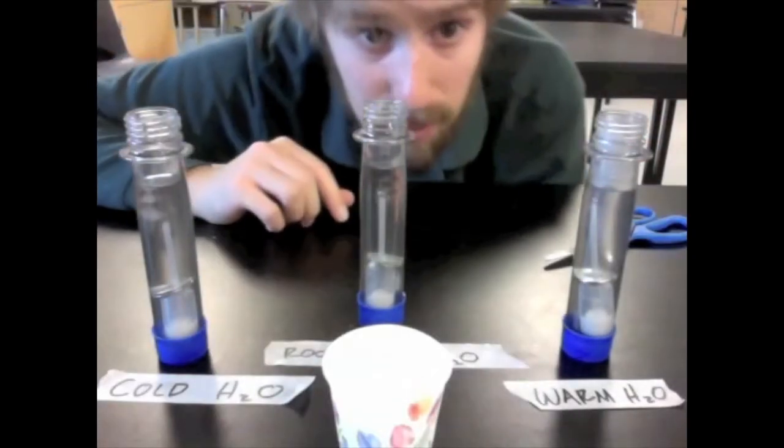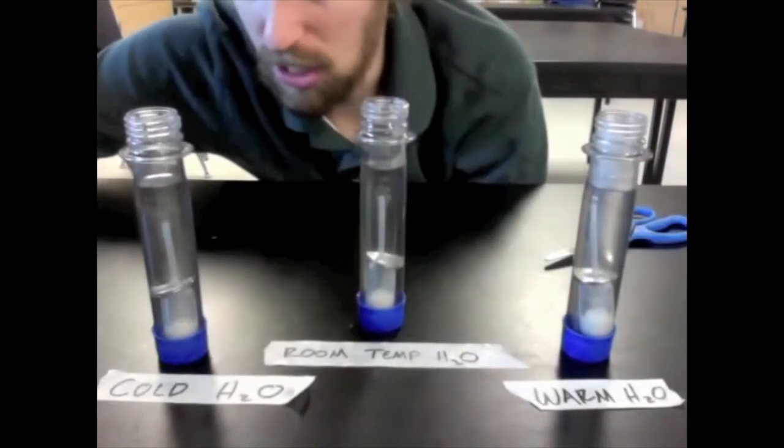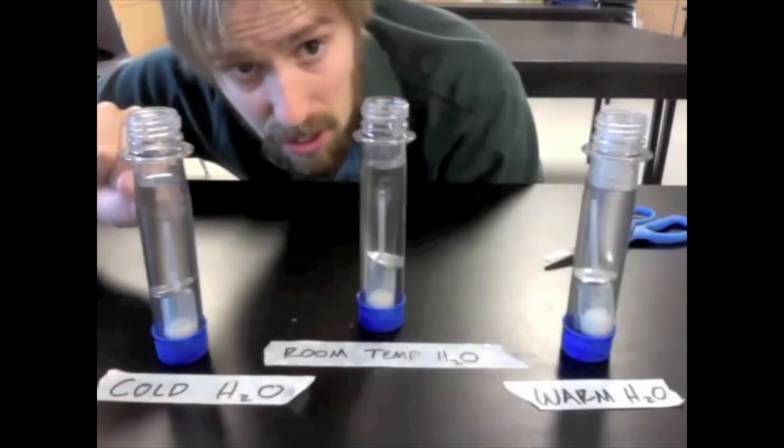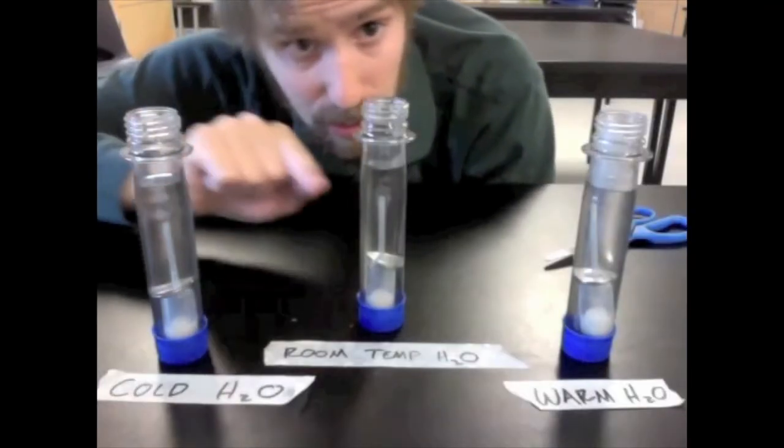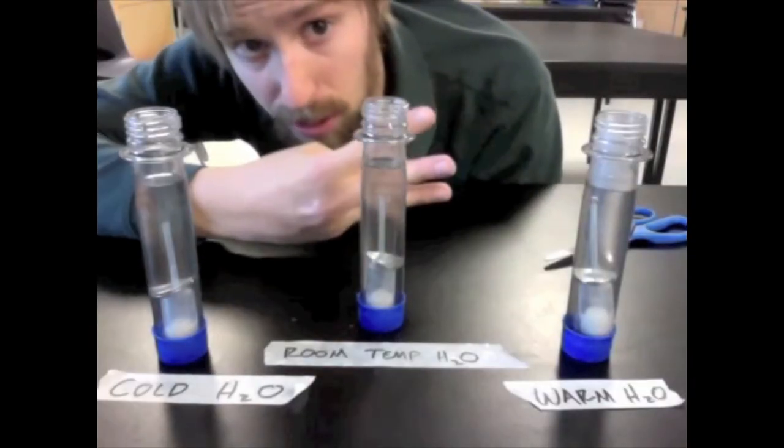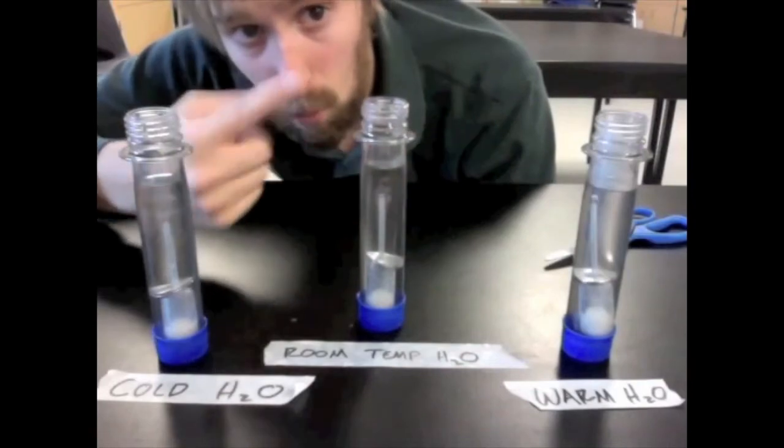All right, now for this to be an accurate trial, we want to make sure that we start collecting data all at the same time. So I'm going to count down from three, and when I give the signal, we're going to start counting bubbles for each one of our three trials. The more bubbles means the faster the reaction of fermentation is occurring. So, three, two, one. Let's go ahead.